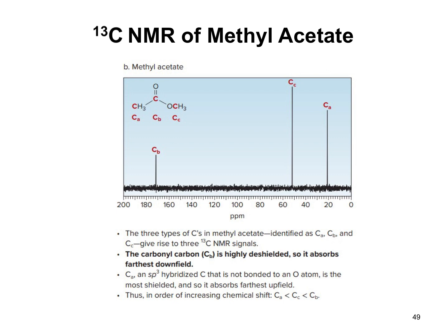Again, just another quick example. Here's methyl acetate. We have a carbon here, a carbon with a carbonyl, and then this carbon is bonded to an oxygen. The carbon of the carbonyl is going to be farther downfield. We're going to see it here, the CB, because this particular carbon of the carbonyl is also bonded to this oxygen. So this carbon is bonded to 2 oxygens, so it's farther downfield. This carbon is bonded to 1 oxygen, so it's going to be here. And then this carbon is bonded to no oxygens and just the carbonyl, so it's going to be here at A.